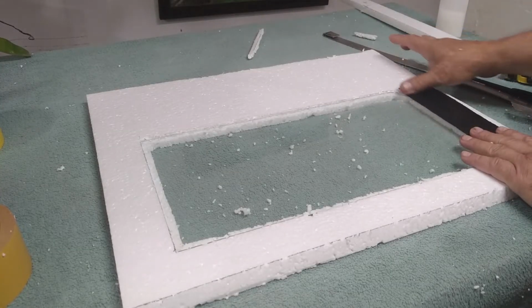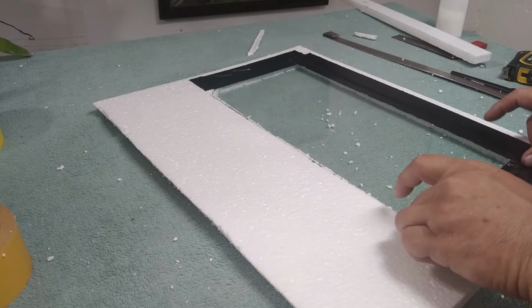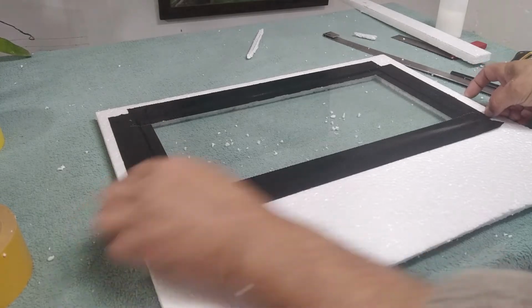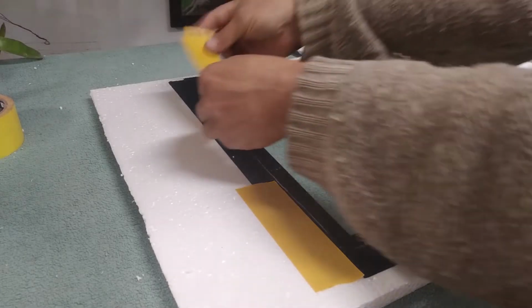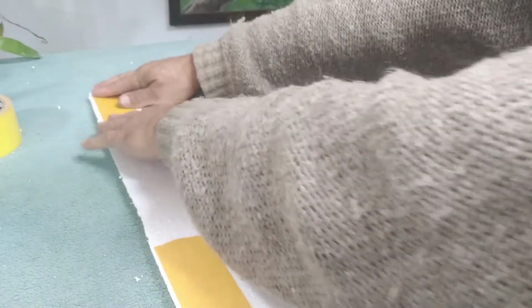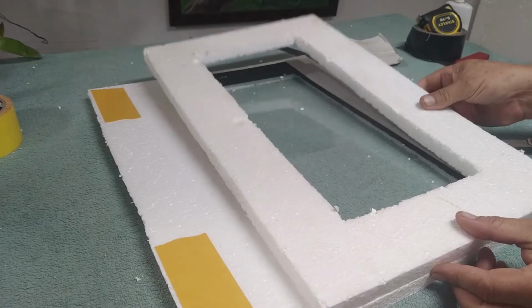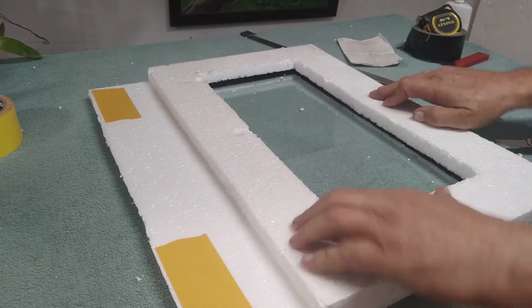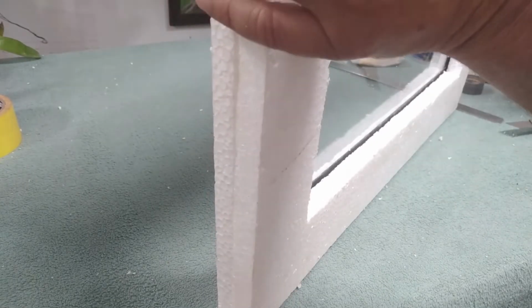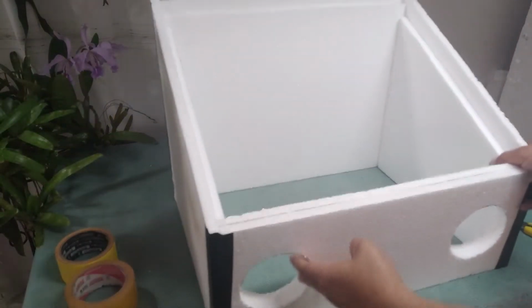Secure the glass in the foam with duct tape all around it. And we have to duplicate it, like every other side of the box. I made this half in two parts just not to throw away some foam pieces that we're going to waste. But it is ideally made in one piece, with no seams.